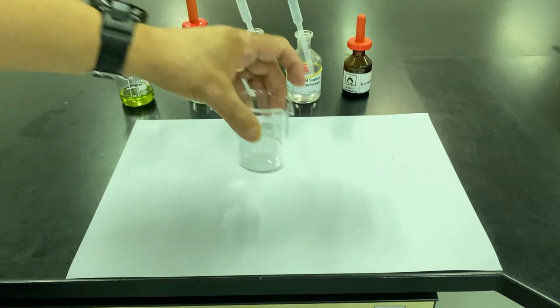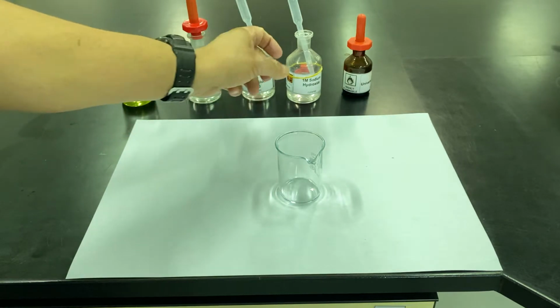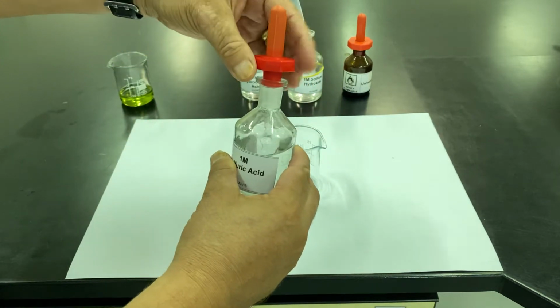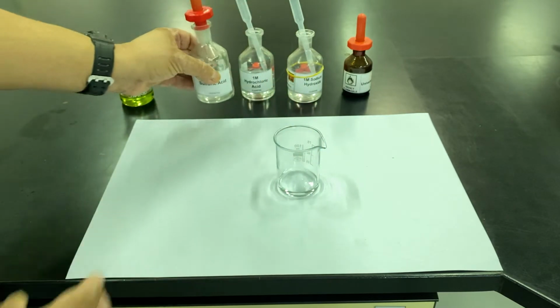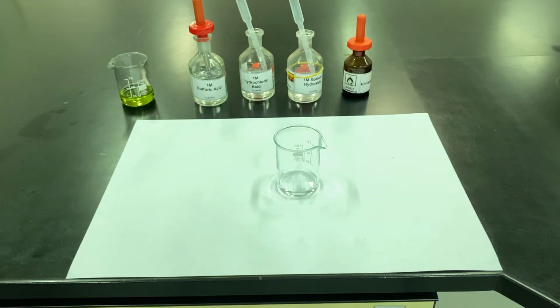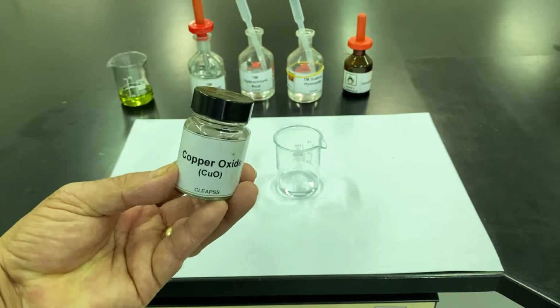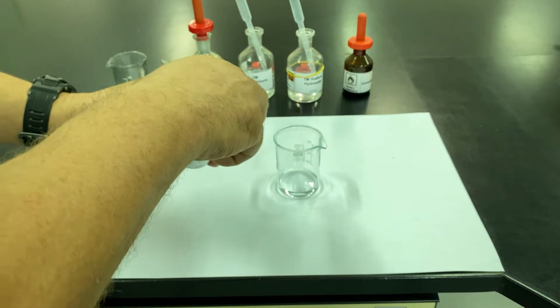Okay, it's another neutralization reaction. Right, now this time I'm going to use sulfuric acid. Okay, if you remember sulfuric acid, what types of salts do they produce? Sulfuric acid produces sulfates. Right, now I'm not going to use an alkali, I'm going to use a base, an insoluble base. Okay, so that's going to neutralize the sulfuric acid.